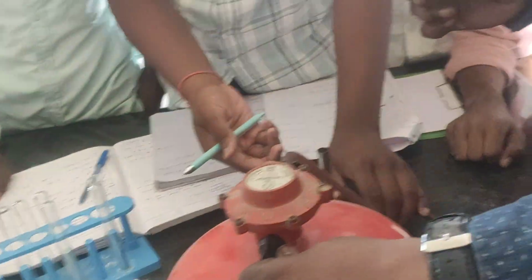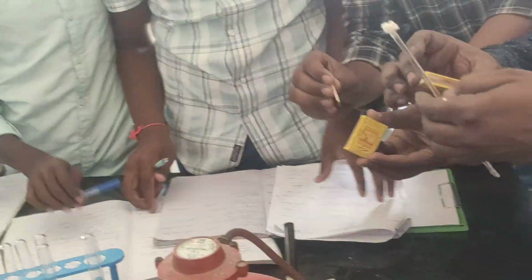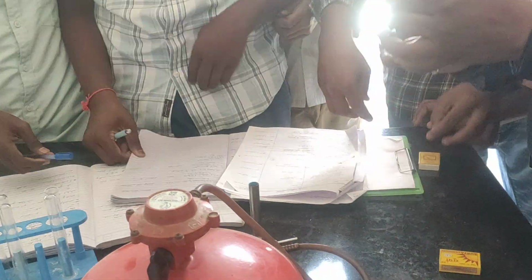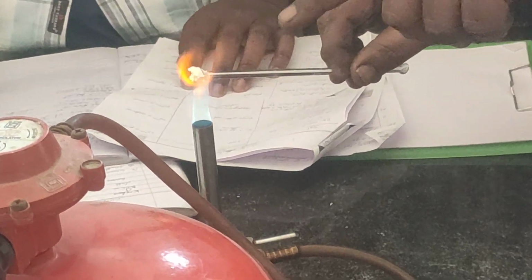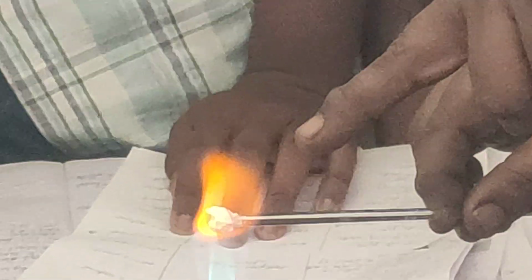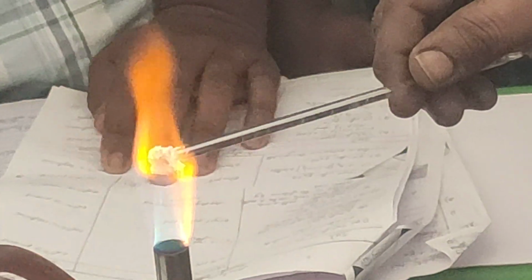I am bringing it near the gas burner. Now observe here, this is very important. See, this is brick red. If you get brick red like this, calcium is confirmed. If you remove it, it will go away after some time, and when I keep it on, it comes more brick red. So this is the confirmation test for calcium.